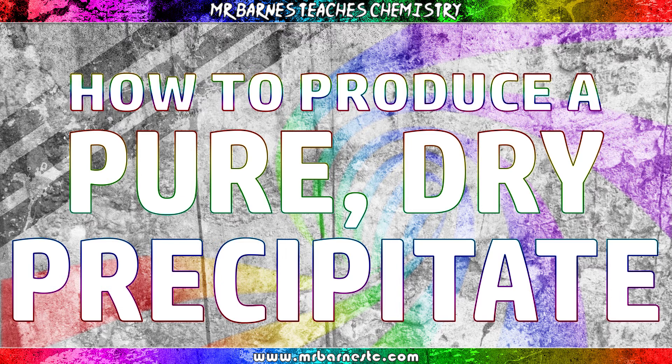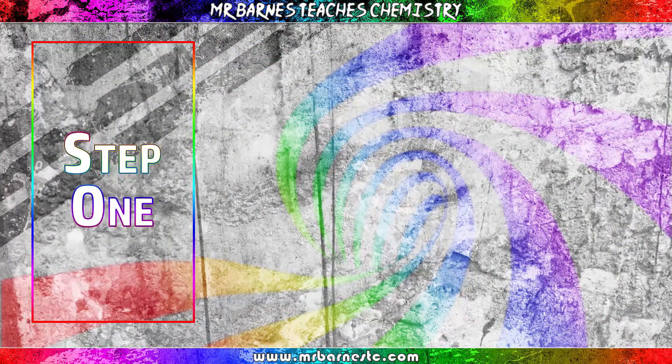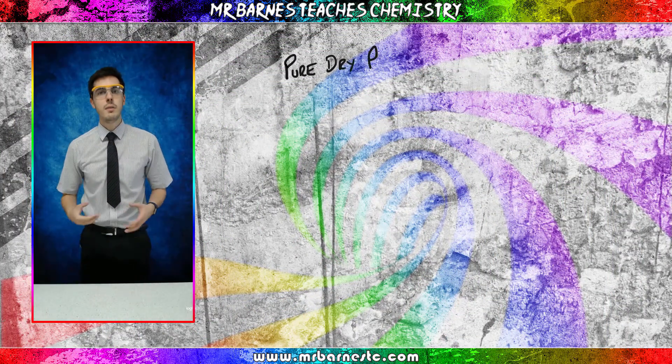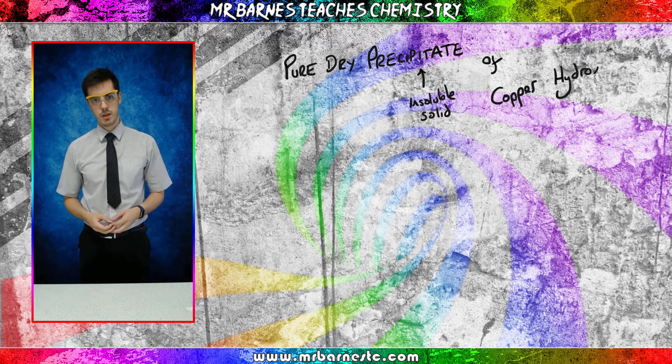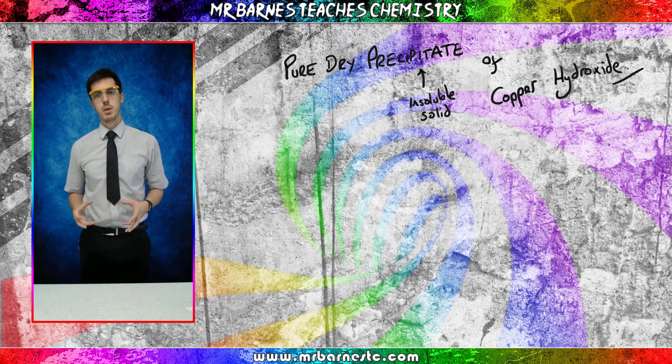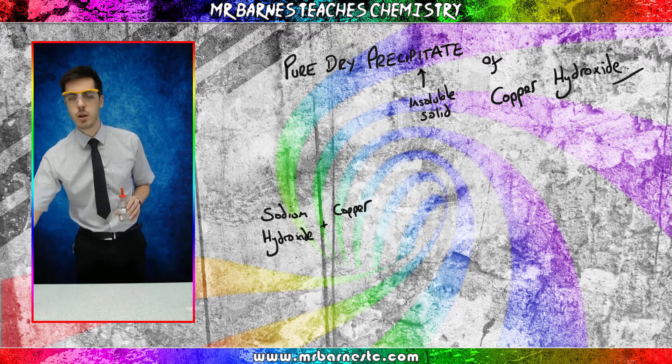Hi guys, welcome to this video looking at how to make a pure dry precipitate. The aim for today's video is to produce a pure dry precipitate of copper hydroxide. To do that we need two chemicals: sodium hydroxide and copper sulphate.